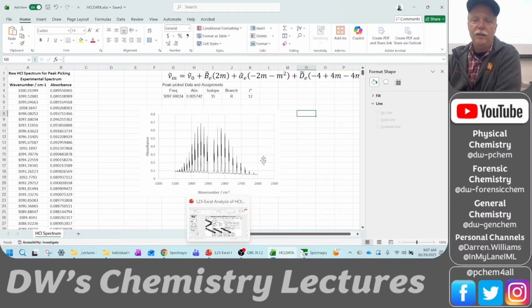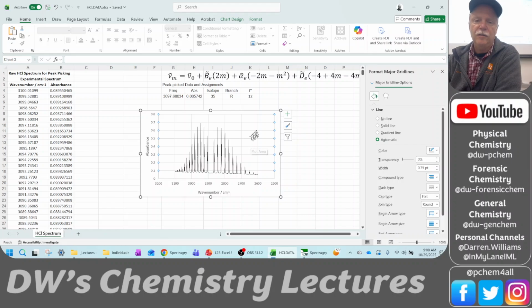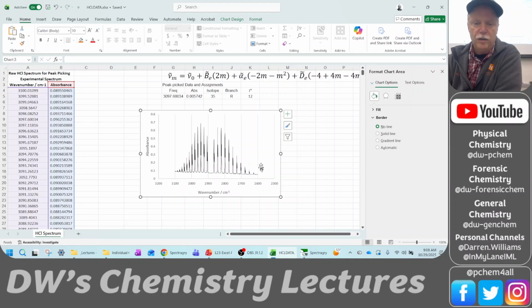I'm not talking about this box. This box is okay. This inner box is fine, but it's the outer box. We don't necessarily need the grid lines. Some people like them, some people don't. I'm going to go ahead and delete them, just make it look a nice clean chart.